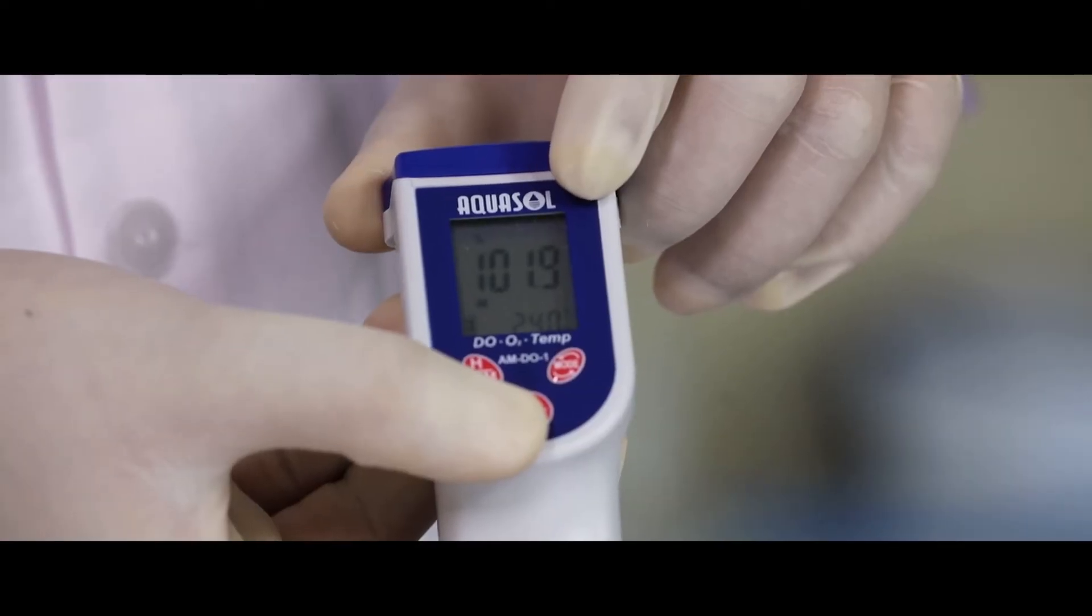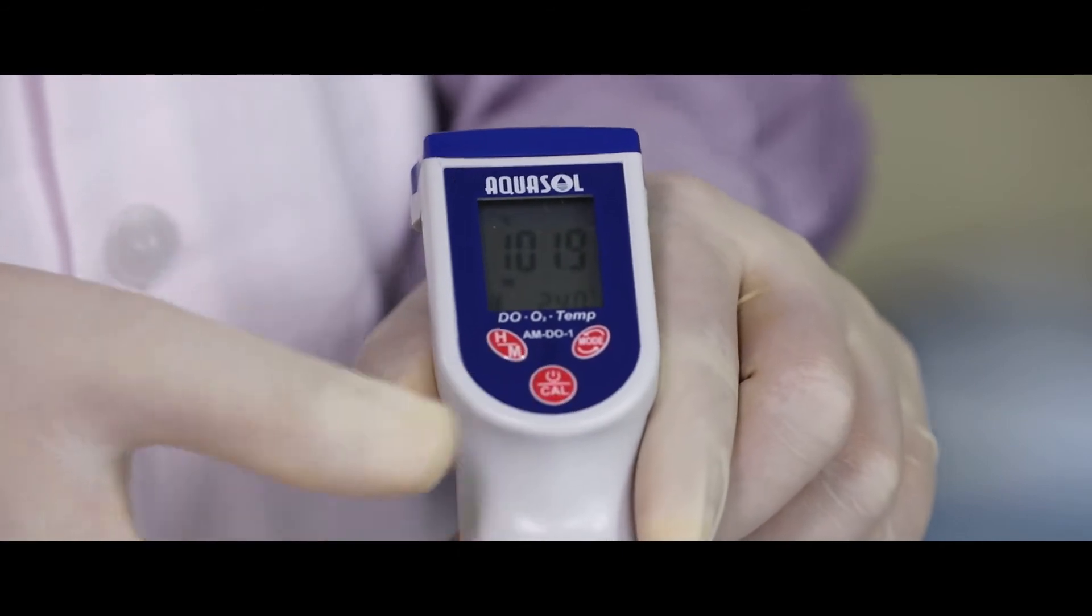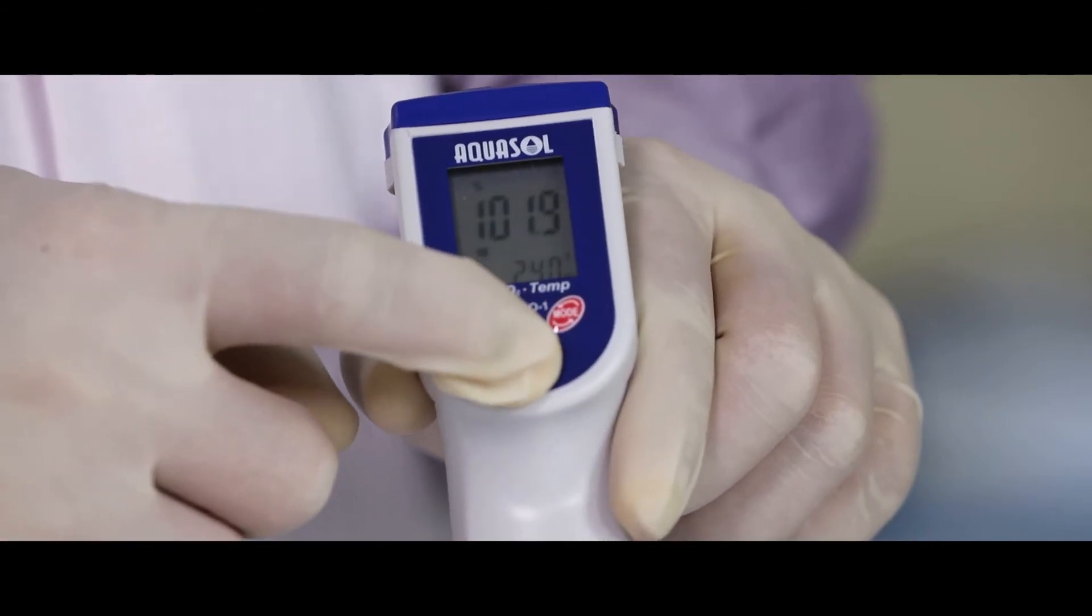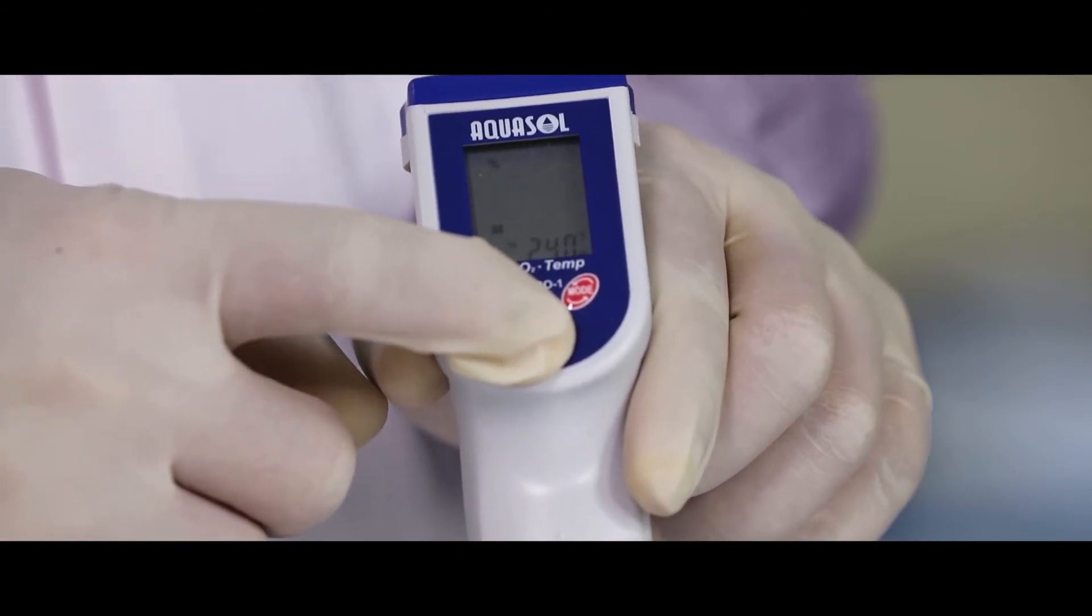Once the meter reaches a stable value, press the CAL key on the meter and the meter will calibrate it to 101.7. Calibration done.